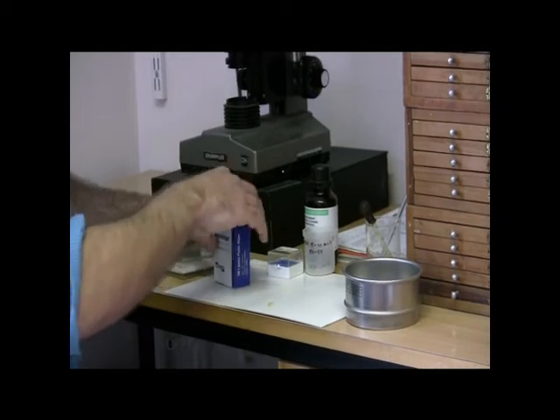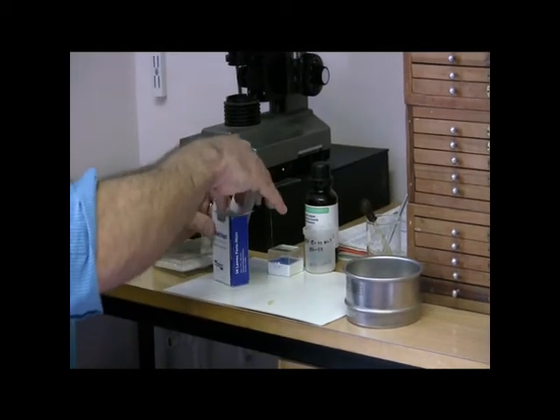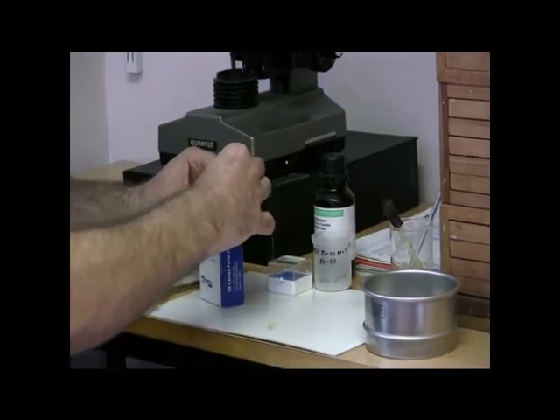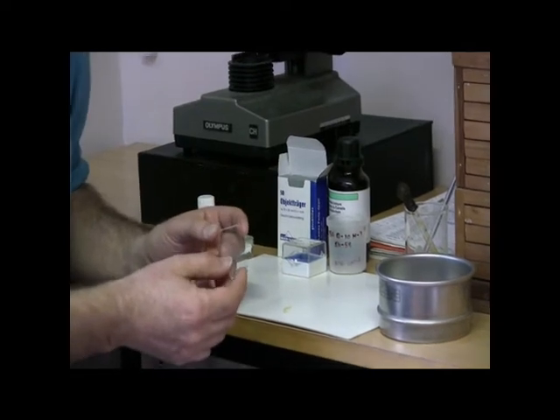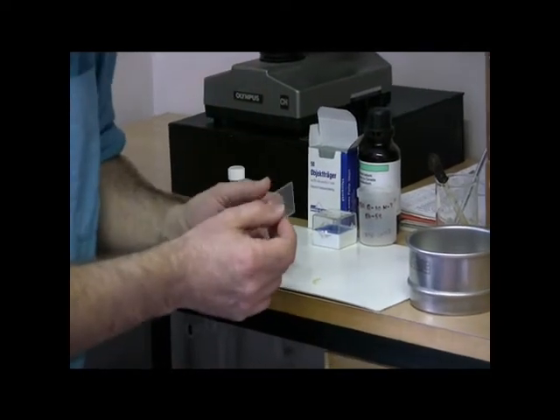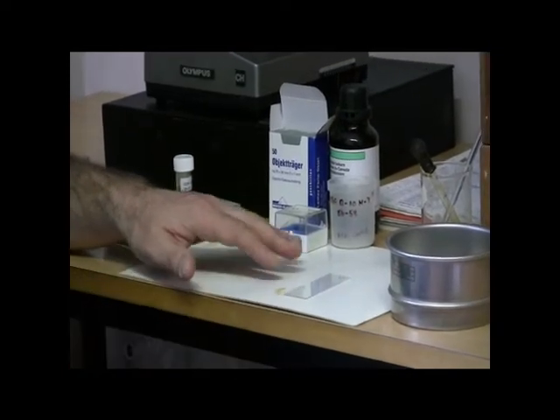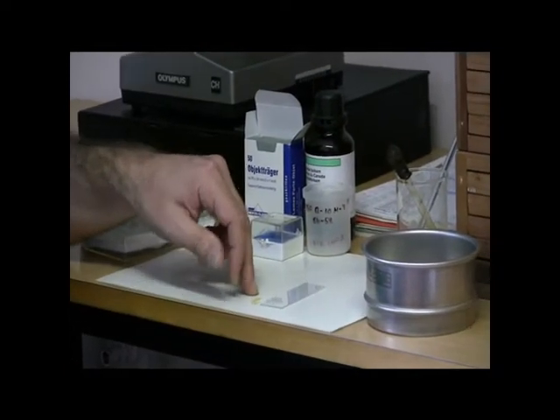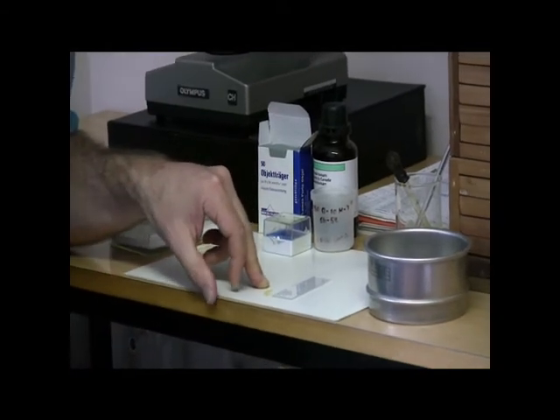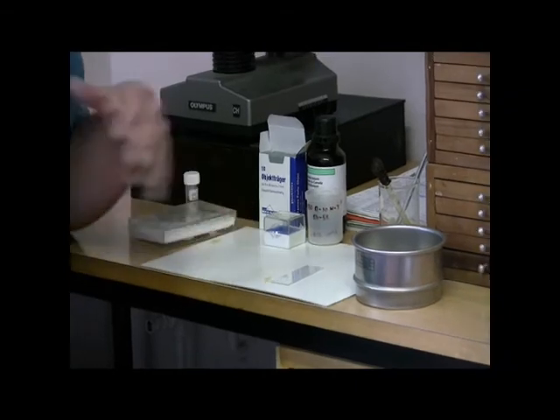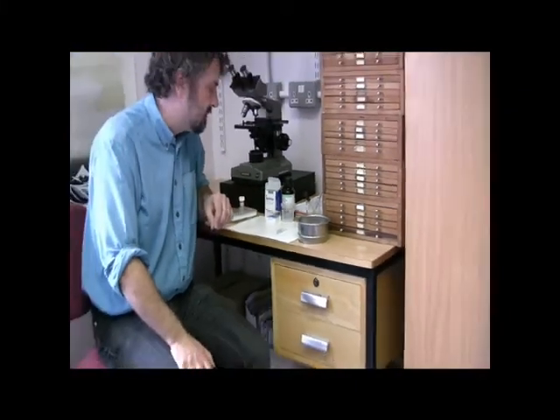What we would do is use microscope slides like this, glass microscope slides, to enable us to look at radiolaria under a transmitted light microscope, similar to the one that's behind me. We would want to put this on a firm surface or ideally we need to put this on a warm hot plate, but I haven't got one here on the desk at the moment.